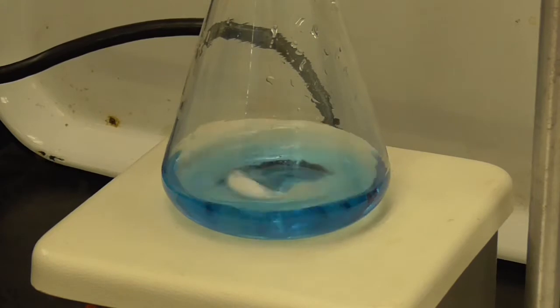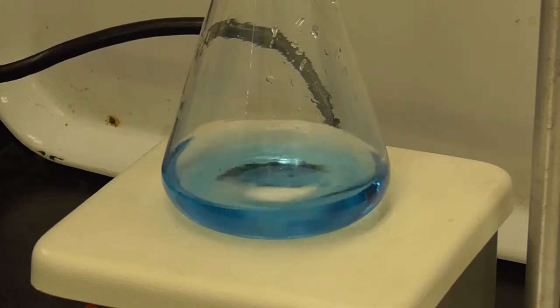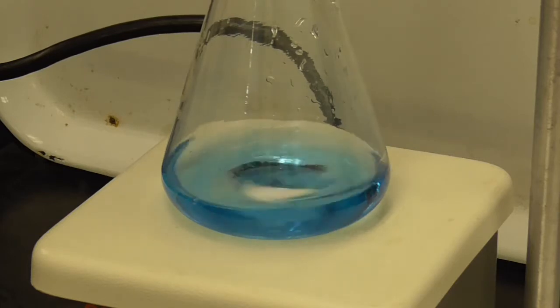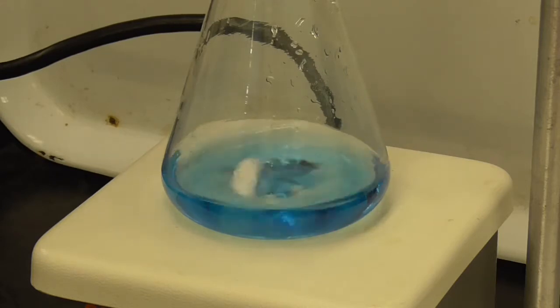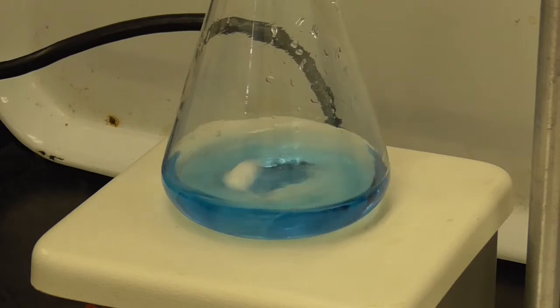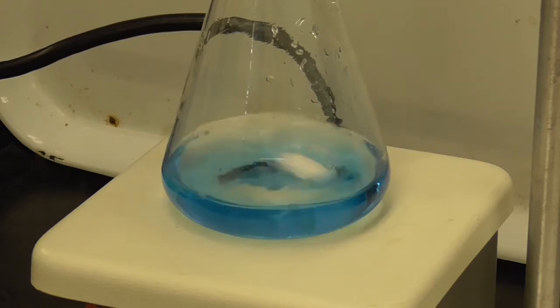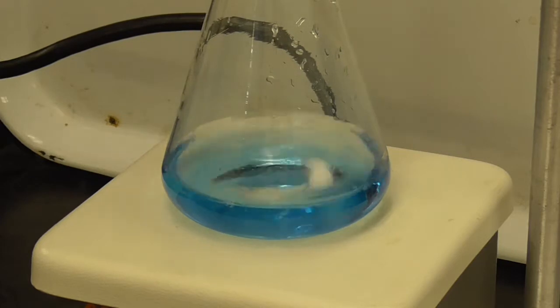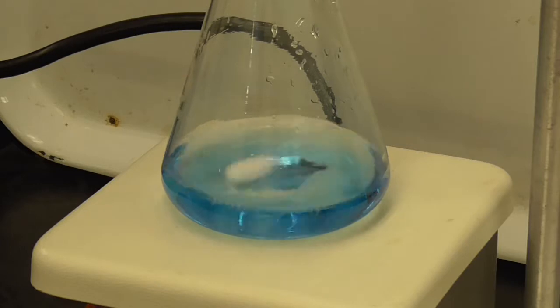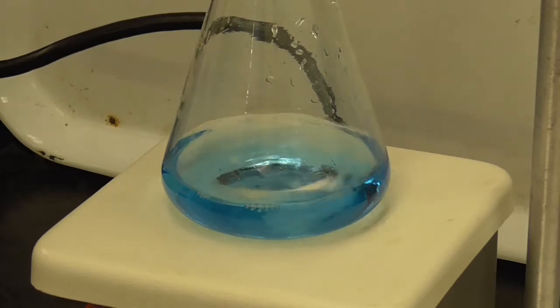Okay, so we're ready to start titrating here. Since I don't have any idea exactly how much this is going to take for the first one, there's a decent chance I could overshoot. But since we're doing 4, if we overshoot on the first one, we may just use the last 3. So we've got to get to a green color and eventually a yellow color.